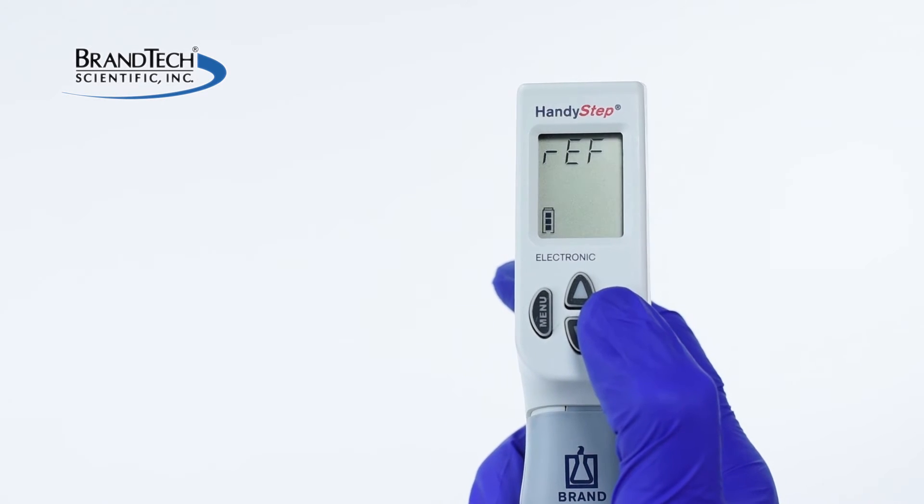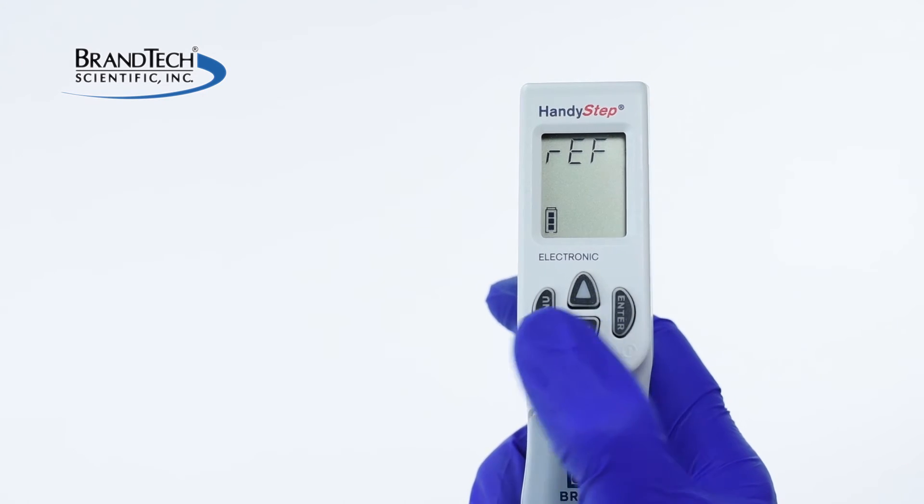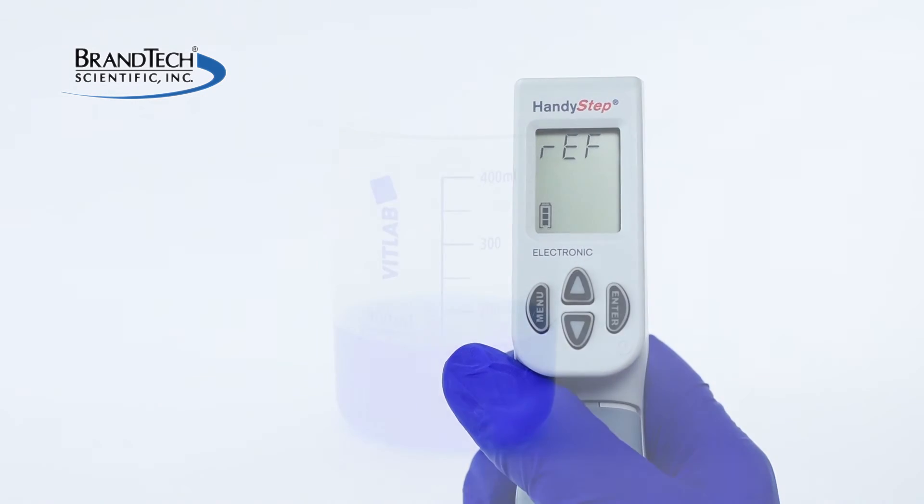To clear this error, push the Enter key and the screen will show the letters REF, indicating a reference run needs to be made.